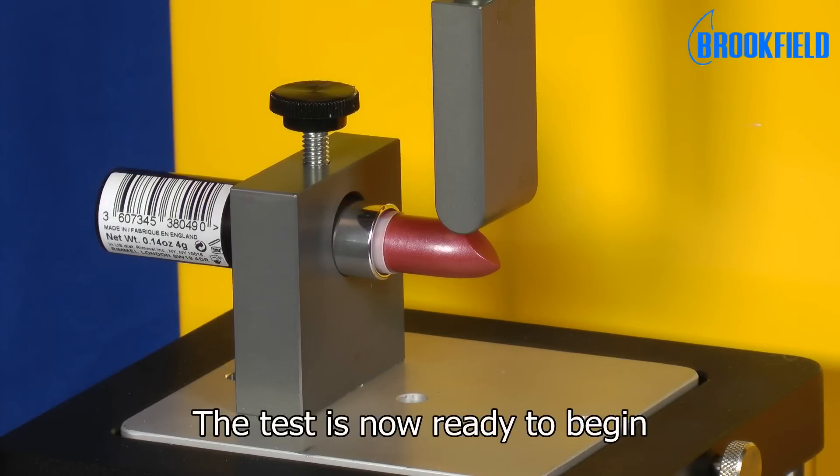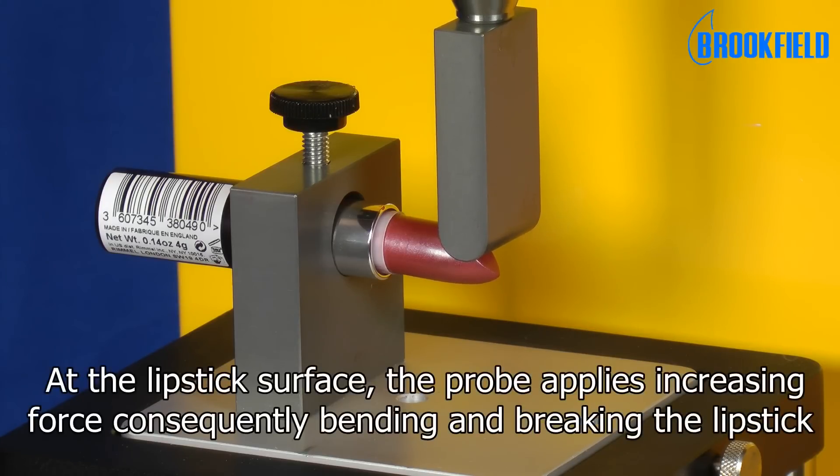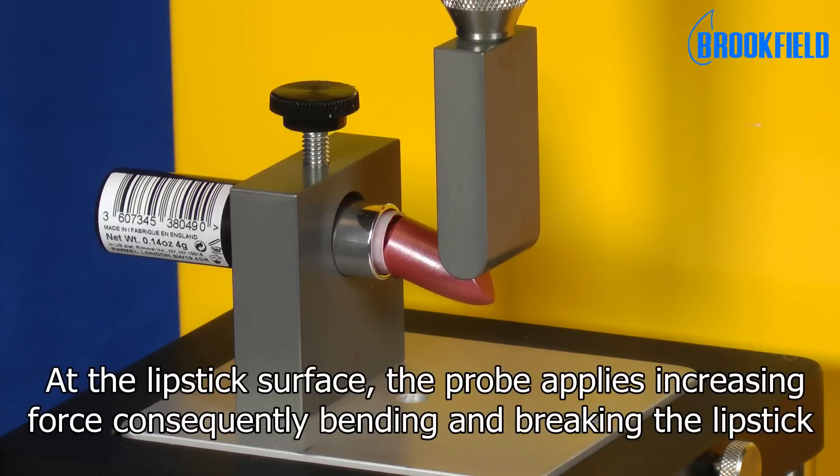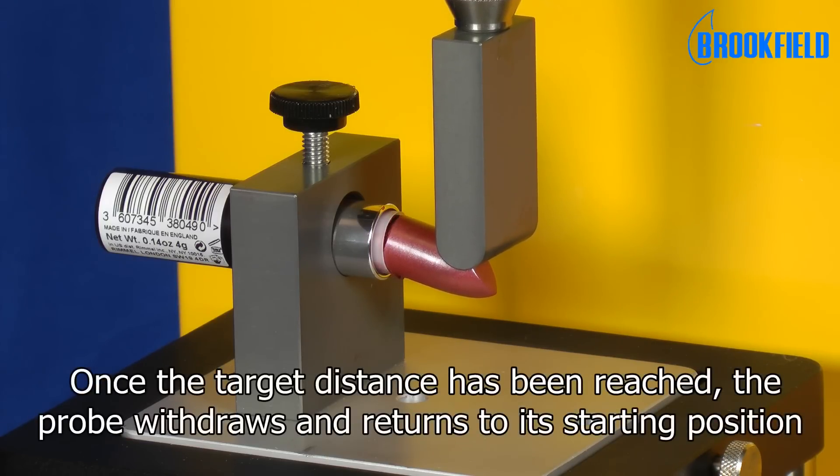The test is now ready to begin. The probe applies increasing force to the lipstick surface, consequently bending and breaking the lipstick. Once the target distance has been reached, the probe withdraws and returns to its starting position.